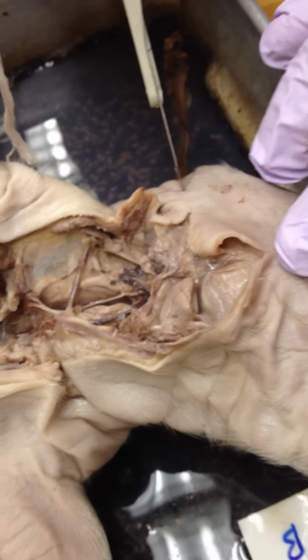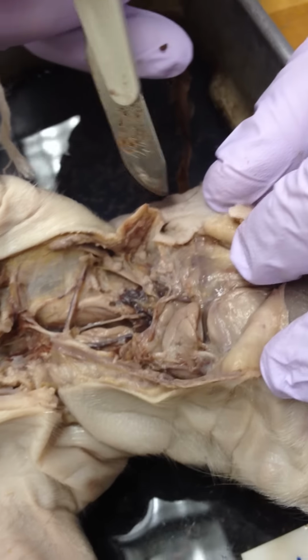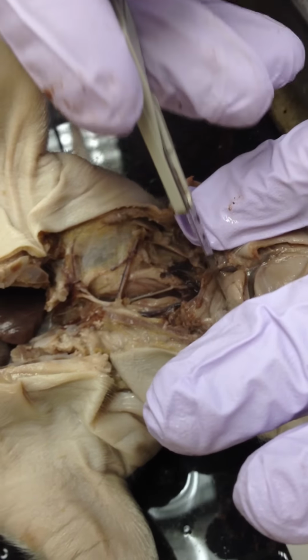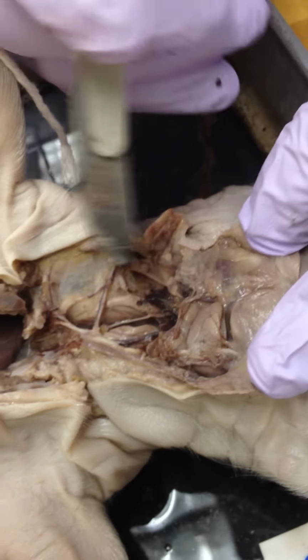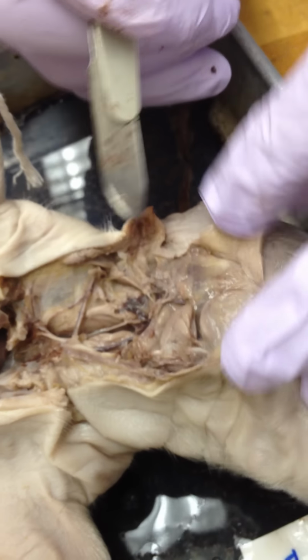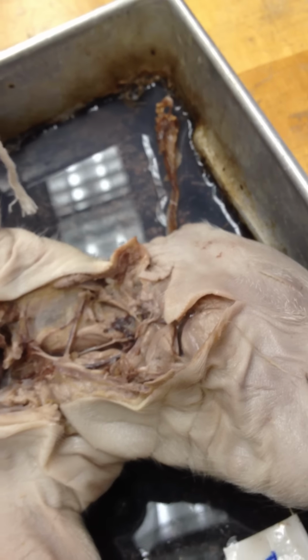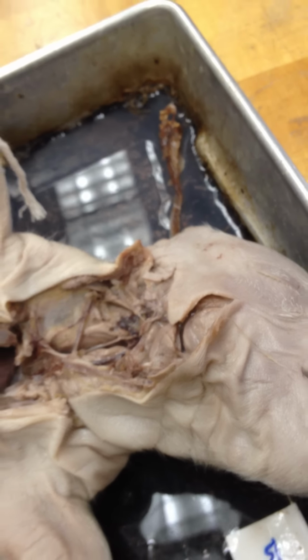So there's the ear, Amanda. So you just go like, I don't know, by a finger that way, and try to just expose it carefully. All right. Let me see if they have a picture in here where they show that, like in a real pig.